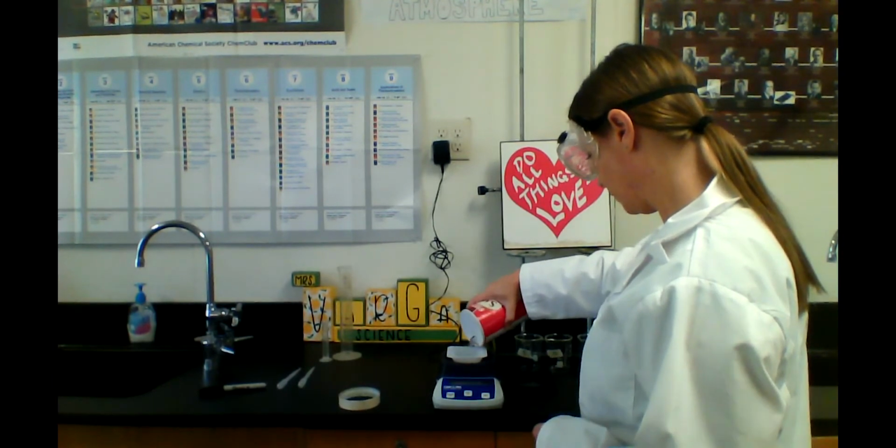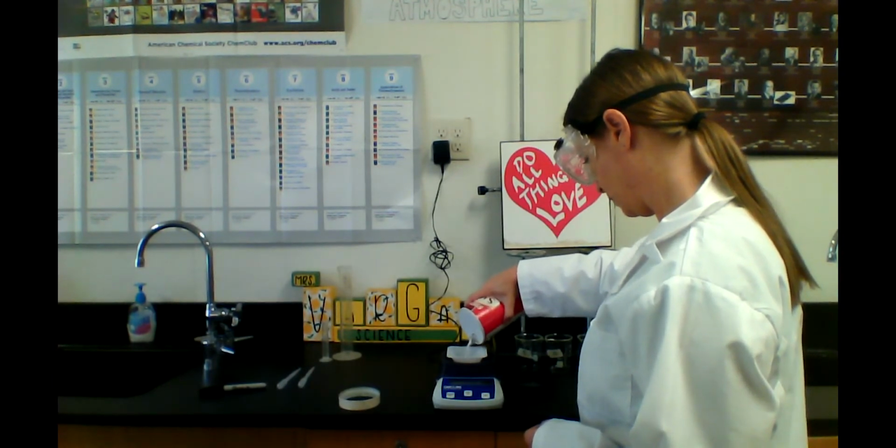We're going to prepare our stock solution, the 25% sodium chloride, for the concentration and density lab. So I'm going to take my weigh dish, and I'm going to zero the balance with the weigh dish. So now that it reads 0, I'm going to add my salt to get to 25 grams. Slowly.